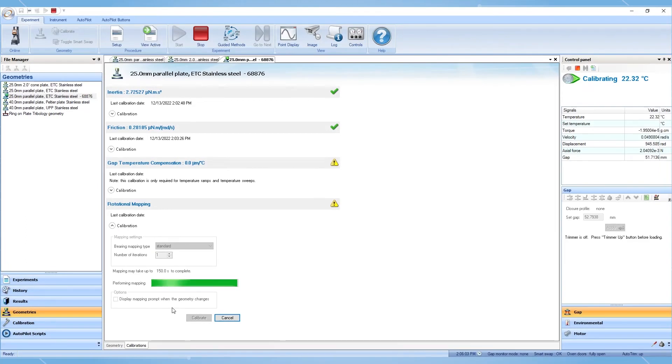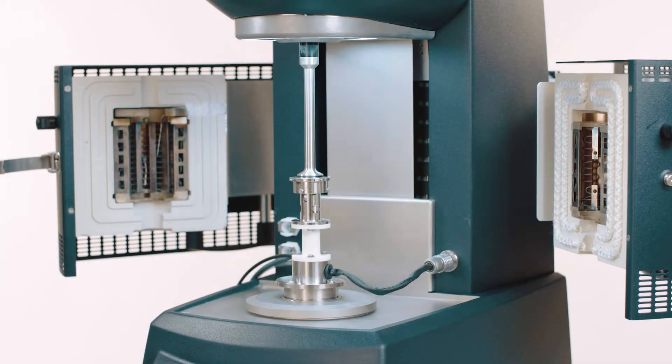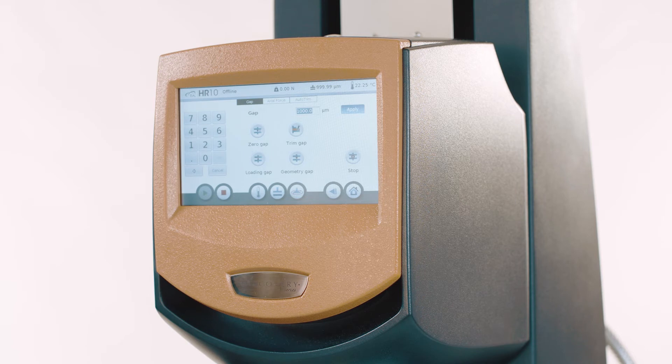Gap temperature compensation is used for temperature ramps and sweeps. Lower the geometry to approximately one to two millimeters above the bottom plate. Equilibrate at the desired temperature for at least five minutes.